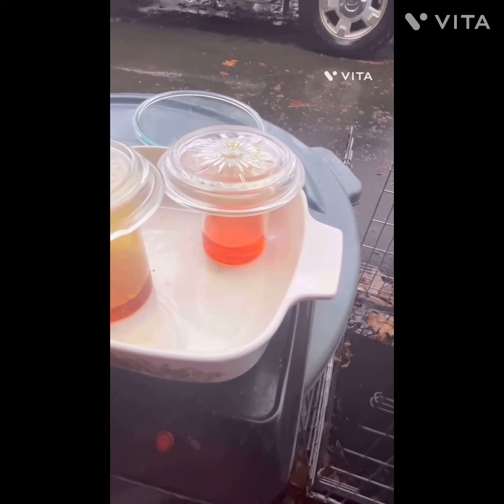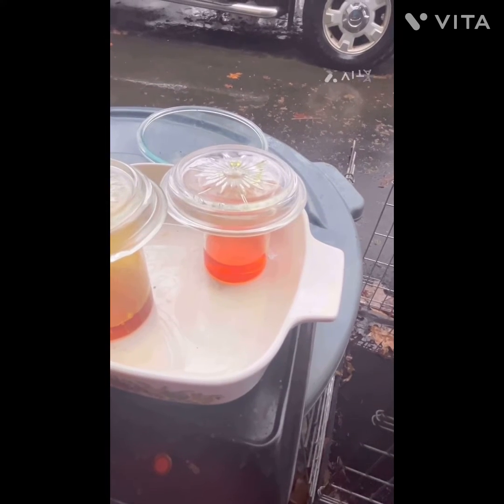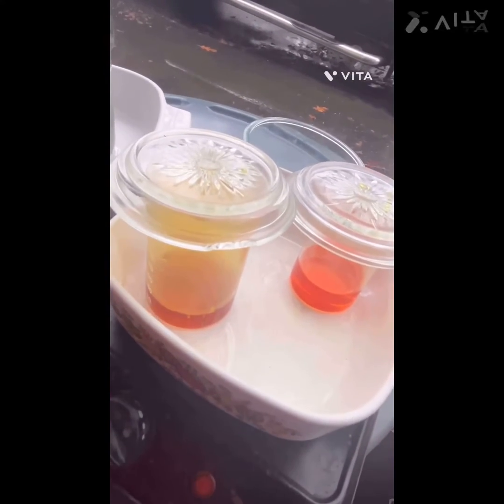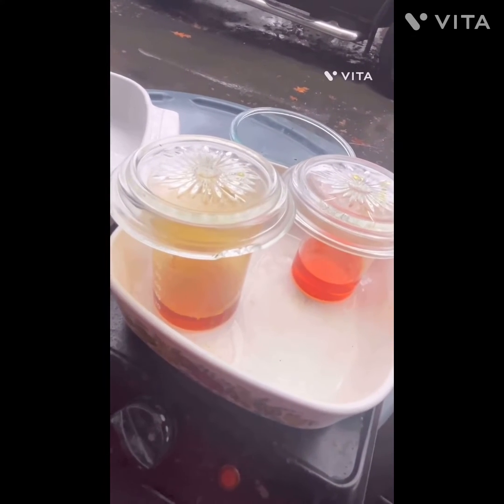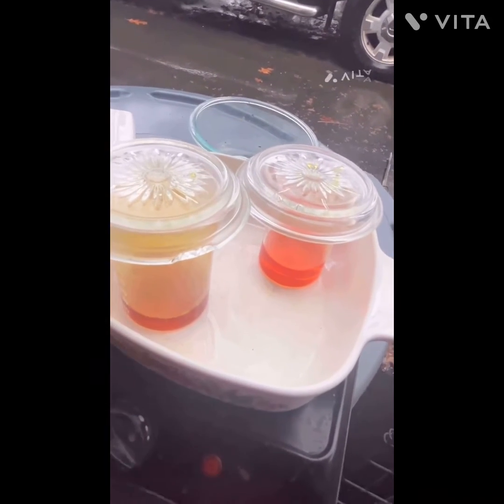We're going to let that cook down a little bit to boil off any excess nitric. Man, that's looking good. These foils that were left over in there are going away too. It's like we'll be dropping today and combining.